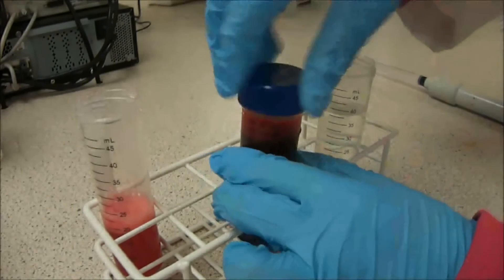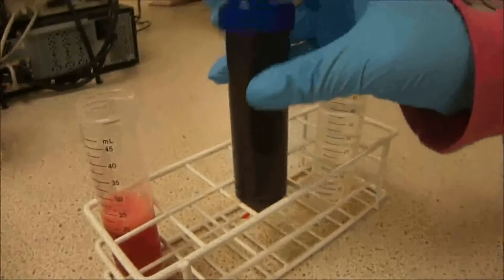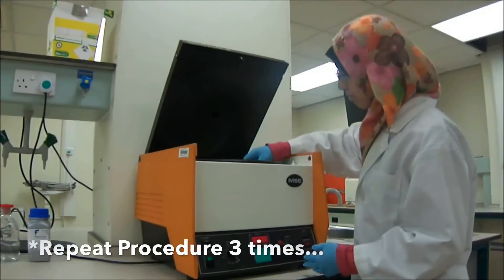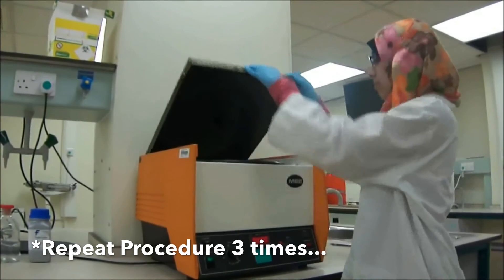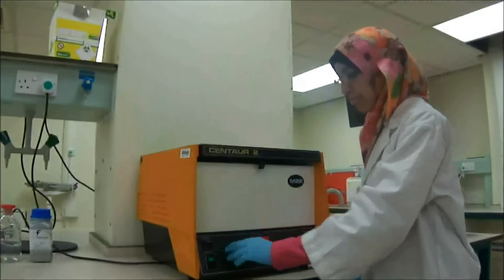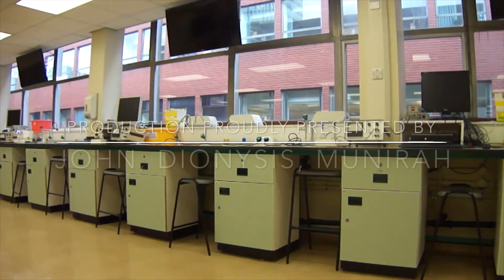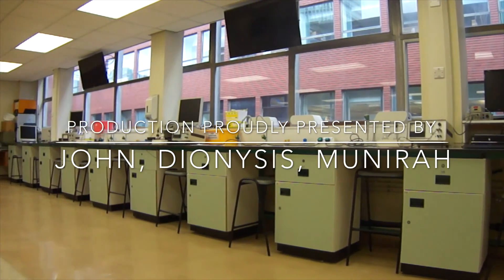Cover the tube and give it a good shake. Once this is done, repeat the procedure a total number of three times to ensure that the blood and plasma are completely separated. And with that, this concludes our tutorial for blood fractionation. Thank you.